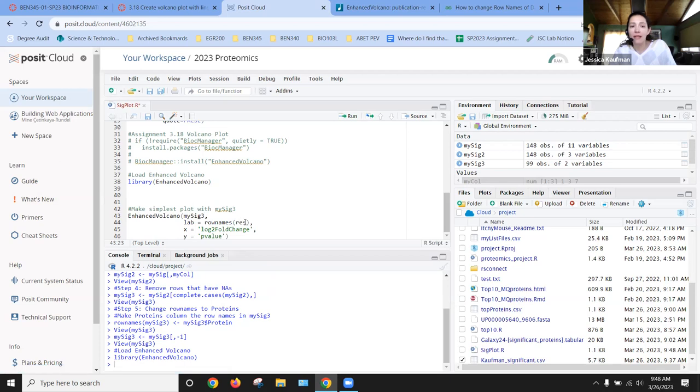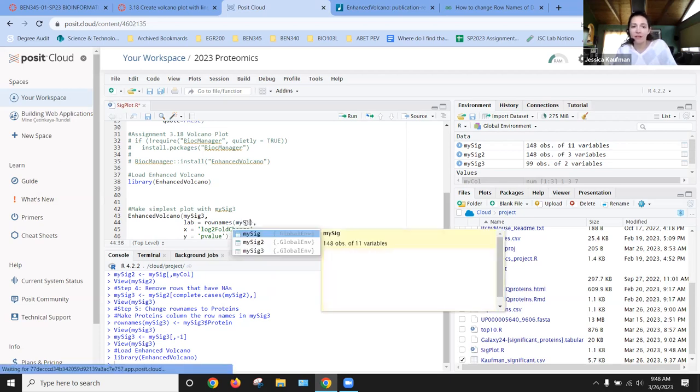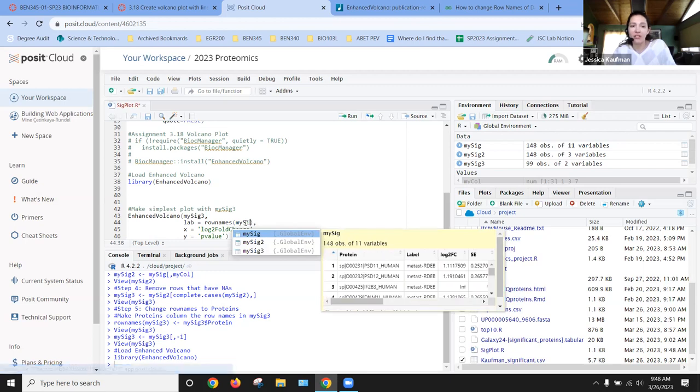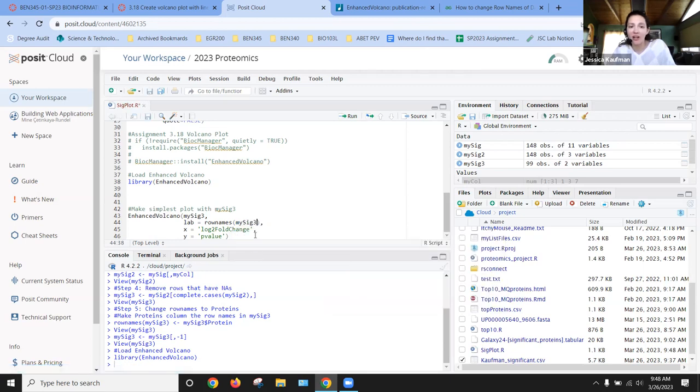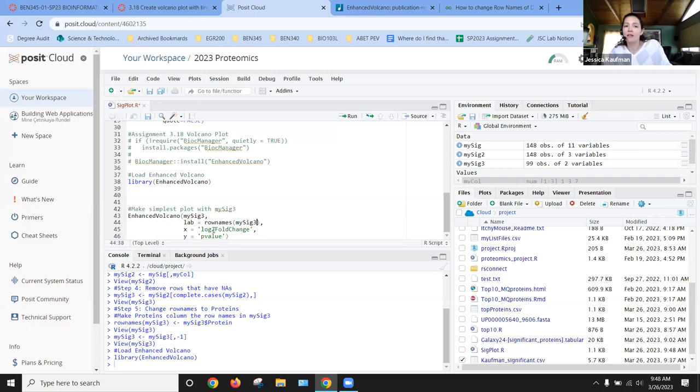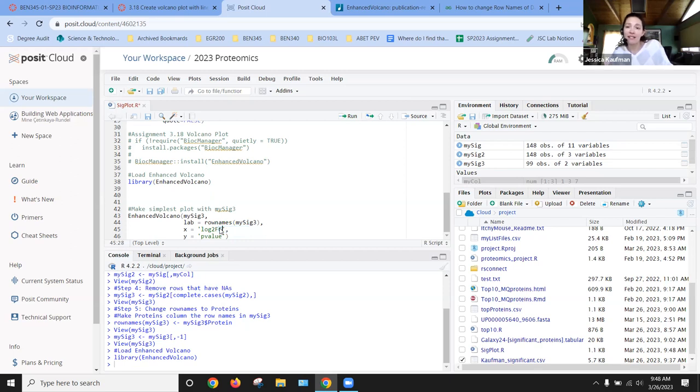The label is going to be the row names from the data frame. Luckily, we just changed our data so that the row names are something meaningful. The x value on the graph should be log2 fold change, but the name of that column for us is log2fc.